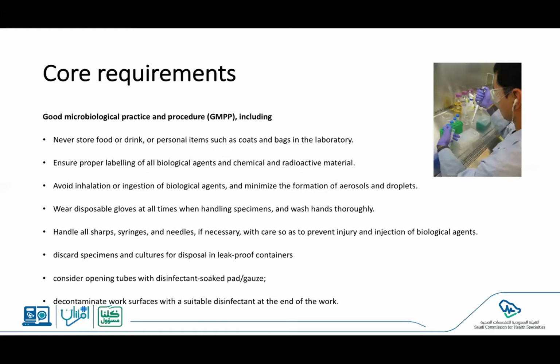I will not go through this in detail because I'm sure that most of you are familiar with this anyway. GMPP, good microbiological practices, need to be maintained in any microbiology lab, which basically means no eating or drinking inside the laboratory, and ensuring proper labeling for all biological agents as well as reagents. Of course, you need to avoid any inhalation or ingestion of the biological agents, and minimize any formation of aerosols or droplets. And of course, we need to wear laboratory PPE when we're handling specimens, and discard any waste appropriately.